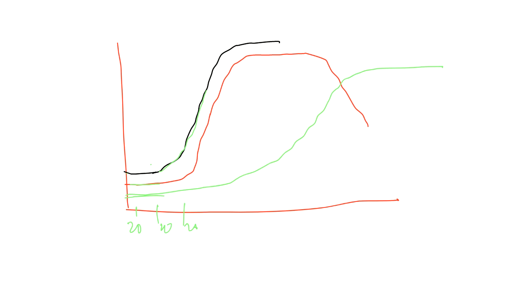I don't know that when you get into the stationary phase, that's kind of tricky to do with a spectrophotometer. But you should definitely see lag and logarithmic phase. You may see the slow down into the stationary phase also, at least for some bacteria, if they grow fast enough. So that's what that exercise is doing, is using absorbance to plot the growth of three different bacteria over a period of time by just measuring absorbance.